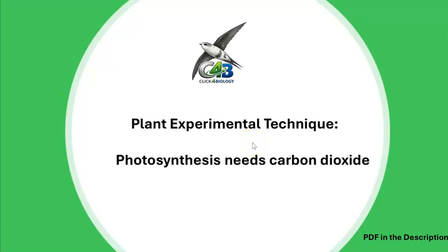We're carrying out plant experiments, particularly on the topic of plant nutrition. And in this particular video, we're going to demonstrate that carbon dioxide is required for photosynthesis.